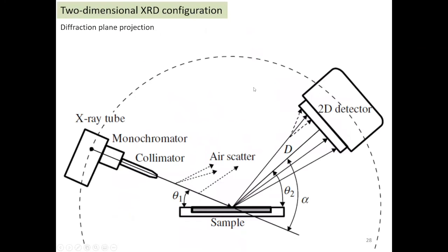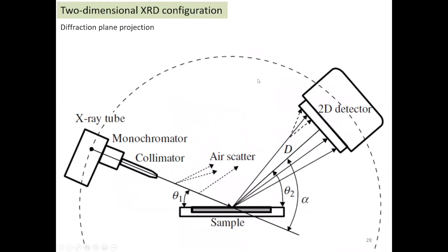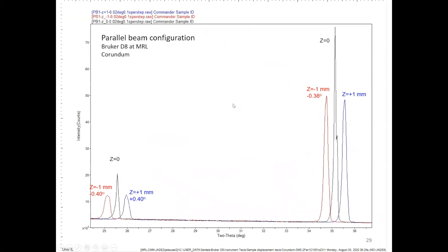And here is the plot that we have showing, for this instrument, for every single angular range, what impact you can cause. And of course, it's larger as I have higher displacement there. So in a nutshell, be very careful how you mount your sample, especially at low angles, and talk to the instrument manager if you see a problem with that.